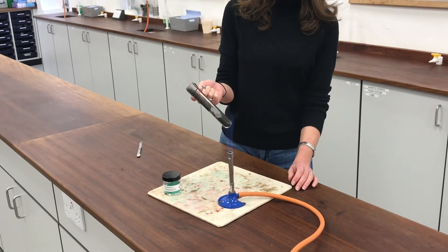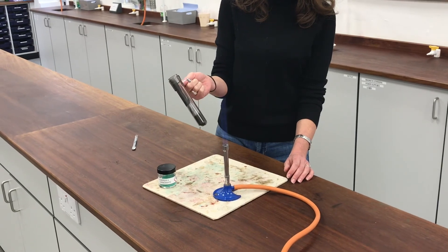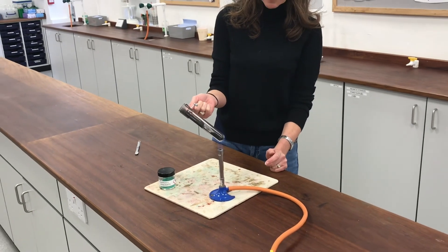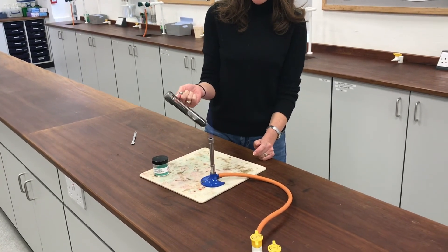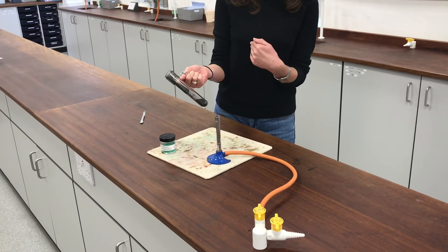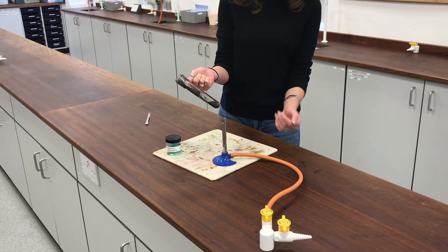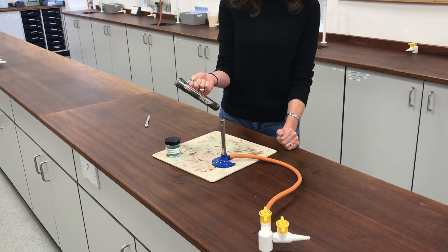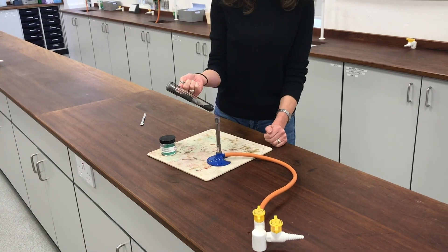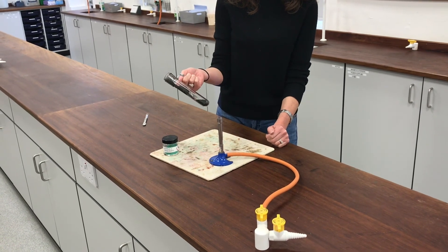My copper carbonate has decomposed really nicely — it's all copper oxide now, which is this classic black colour. I've even got some plumes of black copper oxide coming out of the mouth of my boiling tube. I want you to have a think about whether that process gave me heat energy or whether I needed to give it heat energy for that change to occur. If it was giving heat energy, we'd say it's exothermic; if I needed to give it heat energy, then it's endothermic. Have a think about which one you think it is.